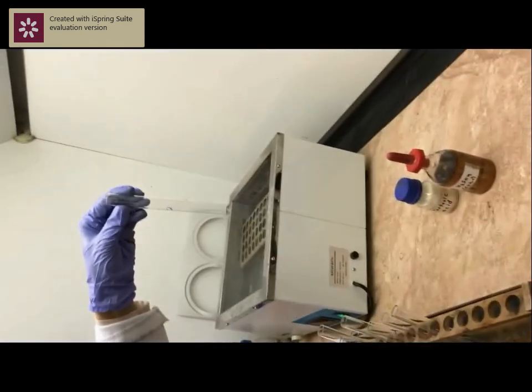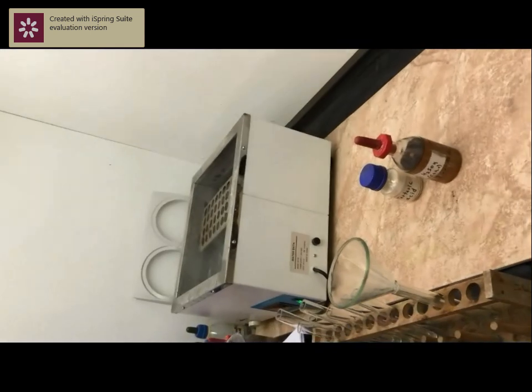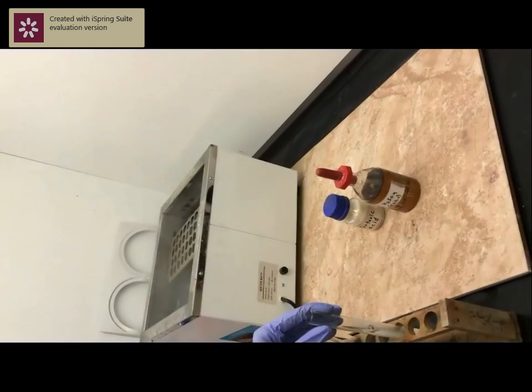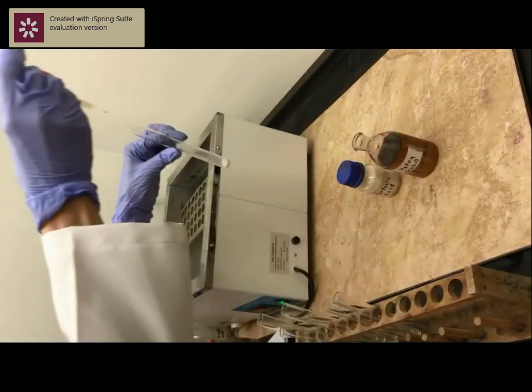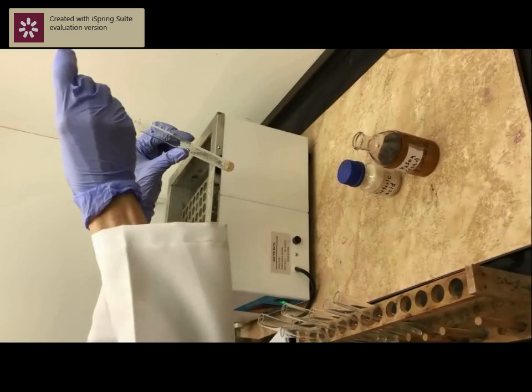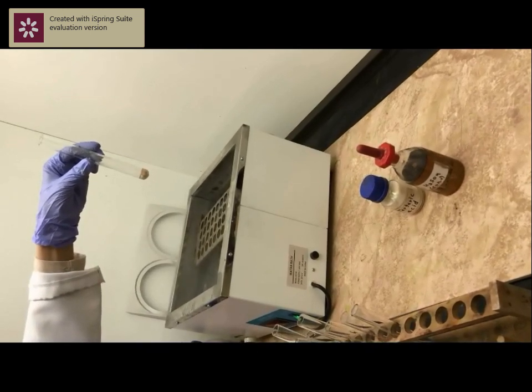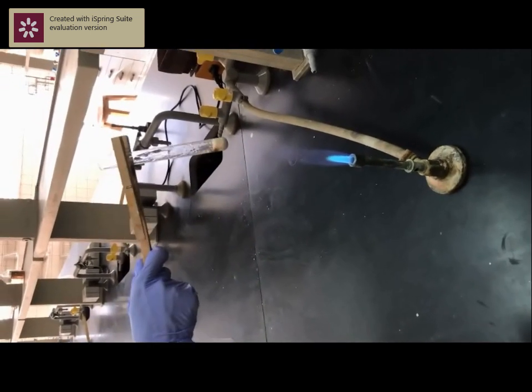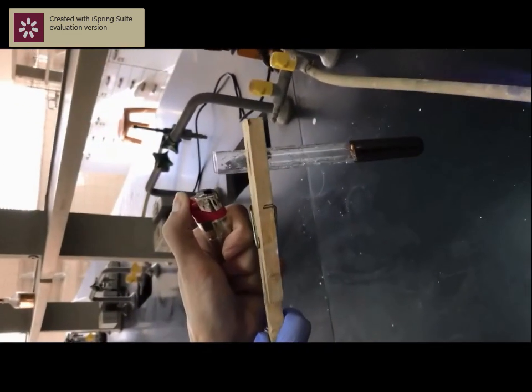Now to start with, bring a clean test tube and start adding 0.5 g of tartaric acid. Add 1 ml of concentrated H₂SO₄. We will identify carbon monoxide by igniting the gas evolved and observing the blue flame. Warm it, note the bubbles and the char on the walls of the test tube. Now we will see carbon monoxide as a blue flame.